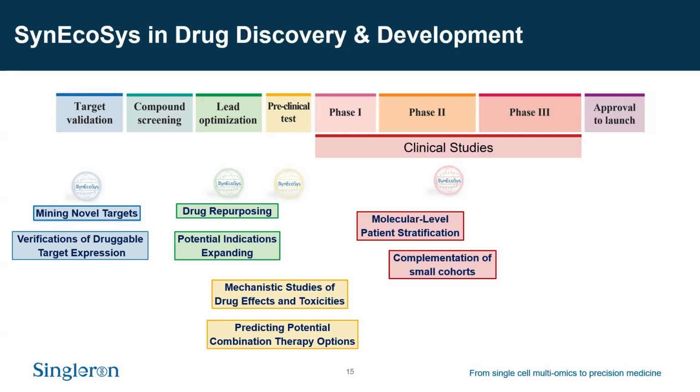Does this sound too theoretical for you? Let me show you an application. For example, mining a novel target. Let's say we are looking for a drug target in colorectal cancer treatment.